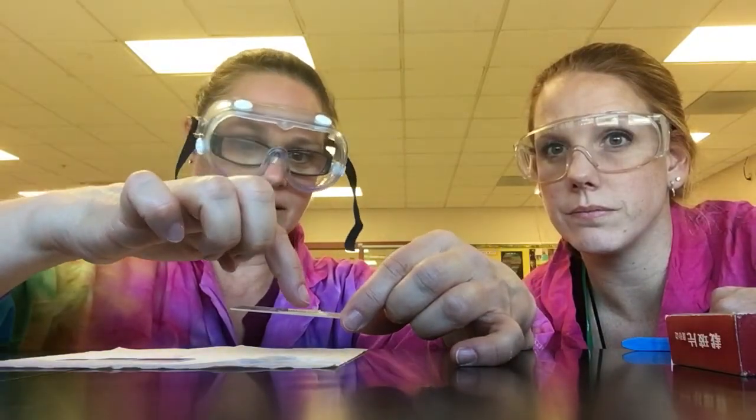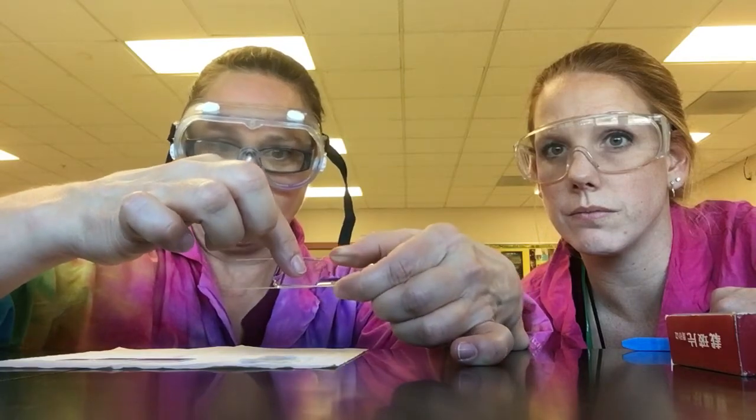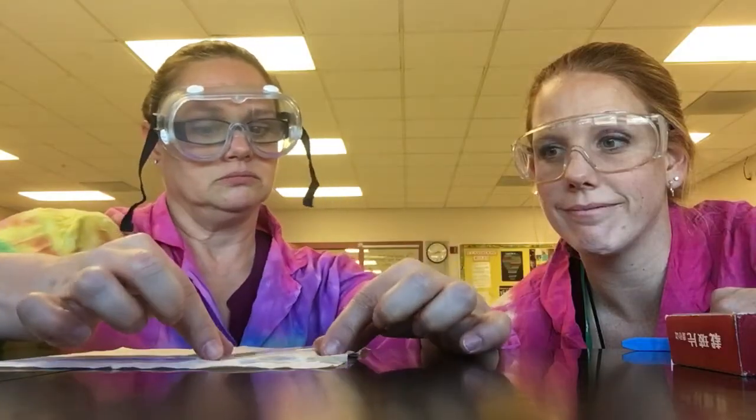The other thing you want to avoid is tapping down on the cover slip, because once you tap down on it, you squish the water out and you'll squish any live samples — and that's no good. So just let it float and carry it very level over to your microscope.